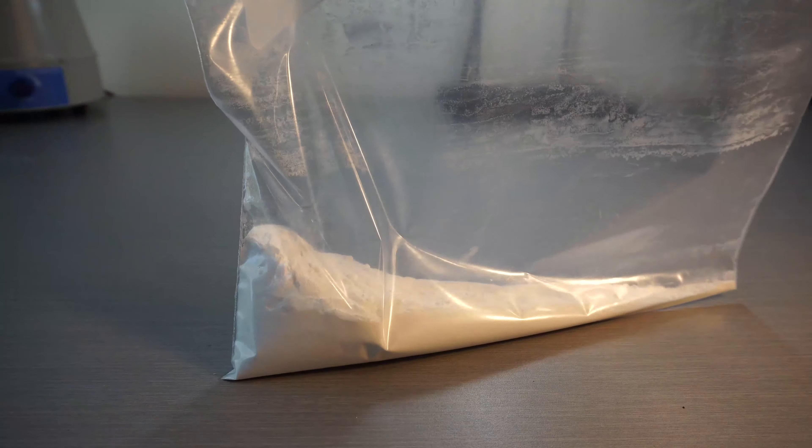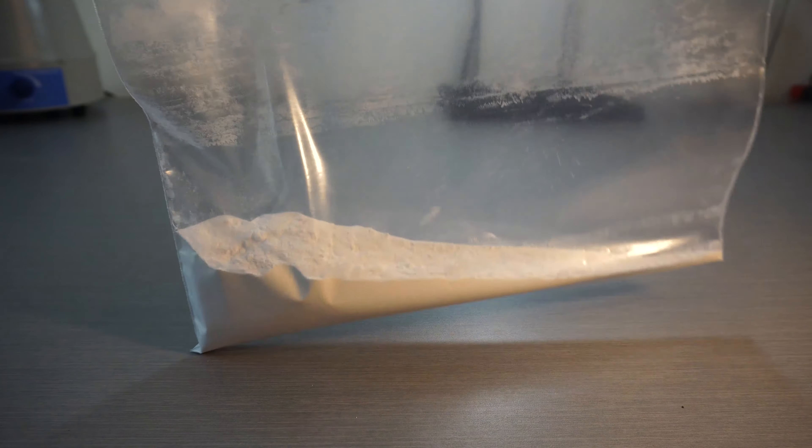Once cooled, we have our washing powder. We will now label and store it for future use.